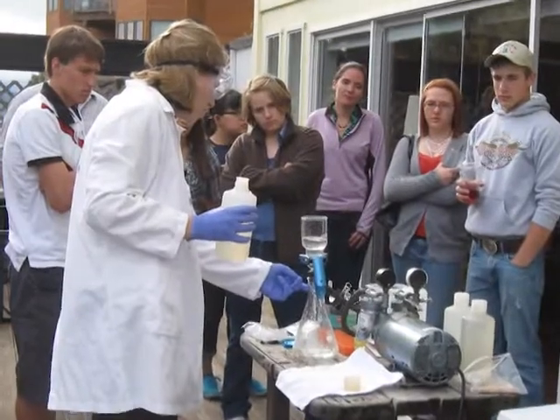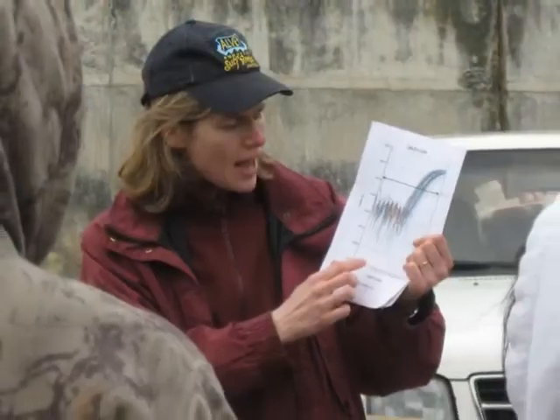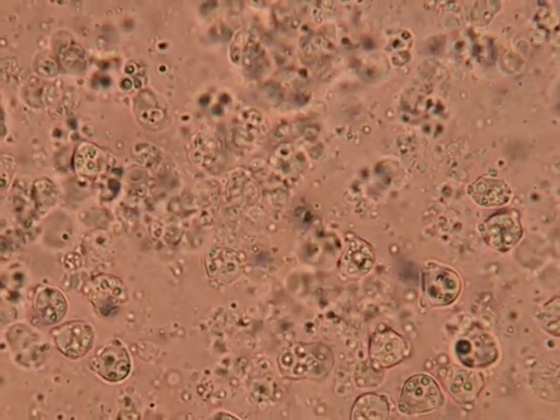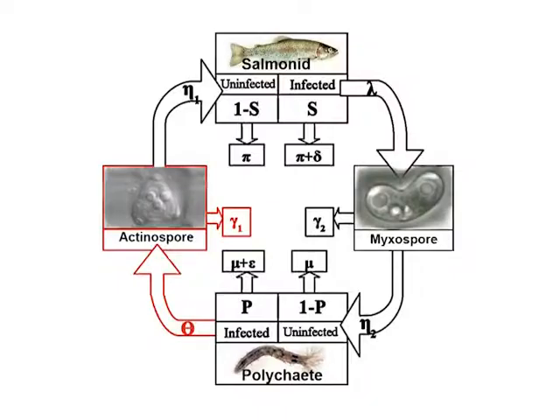Dr. Hallett demonstrated water filtering, DNA, and qPCR analysis techniques to Klamath Falls High School students. When we started applying this method to real river water samples, we measured as many as 100 spores per litre at some sites. Knowing these numbers will help us to better understand when and where the parasite is most abundant in the river, and also to model the parasite life cycle.